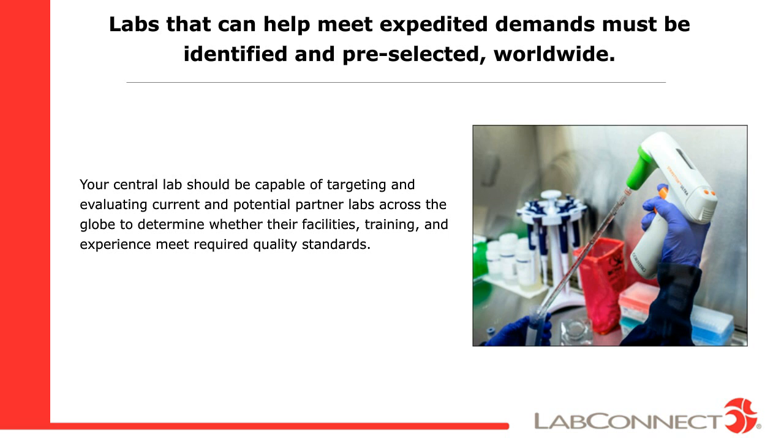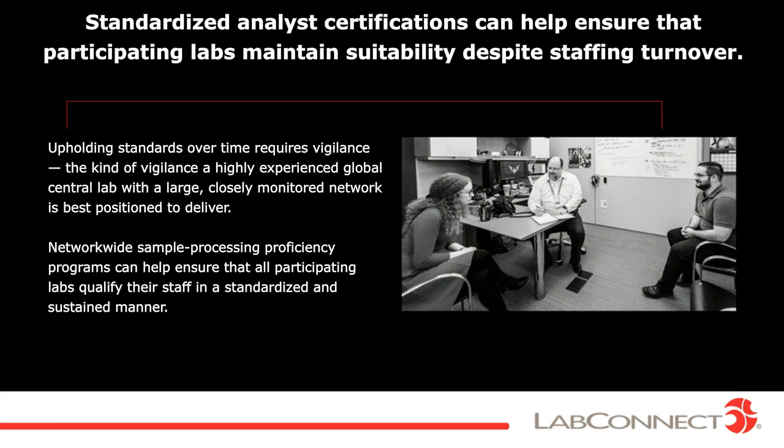Consistency in processing is a critical factor. All labs will have personnel attrition. However, a robust training and qualification program will ensure processing continuity. Having globally standardized protocols ensures uniformity in training and consistent quality expectations.